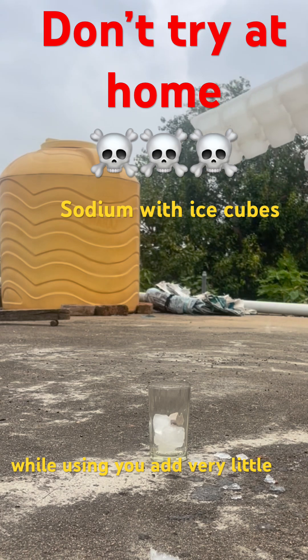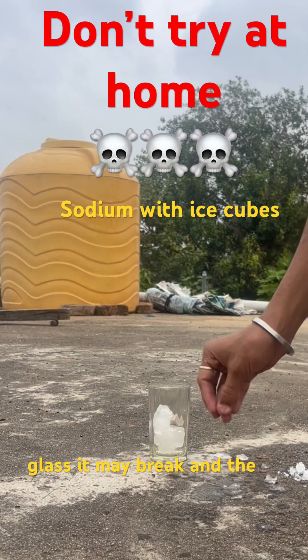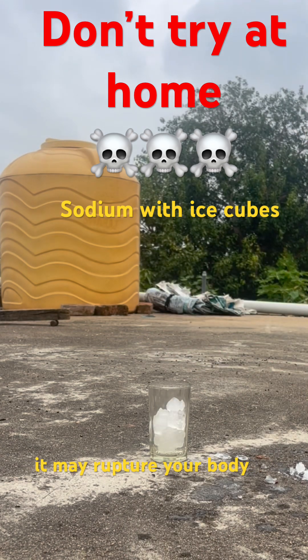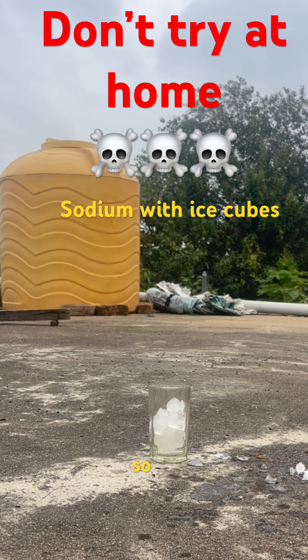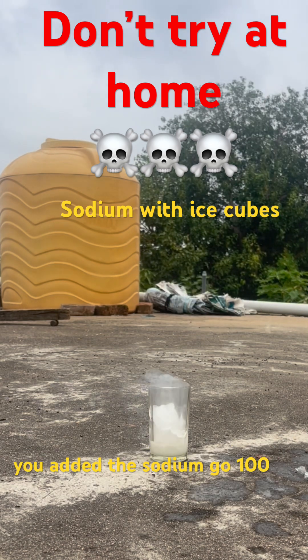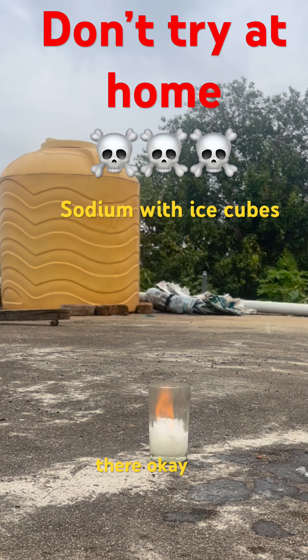Use only a very little amount of sodium. The glass may break and the glass pieces can act like bullets — they may rupture your body. So do it carefully, and once you have added the sodium, go 100 kilometers away from it. Don't stand there.